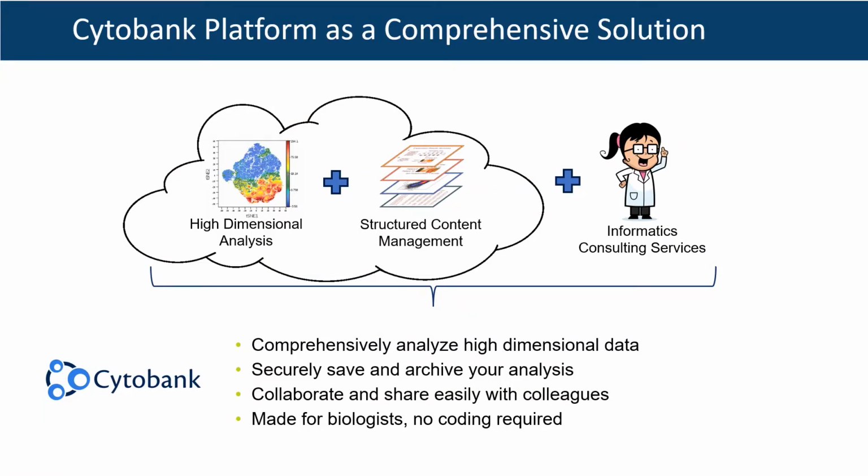And another great part about the Cytobank platform is that it was made for biologists. So we're not going to have to worry about coding when we're talking about accessing these algorithms. These algorithms are going to be able to be fully accessed within the platform without having to worry about coding or without having to worry about installing any plugins. So all of that's located within the cloud.